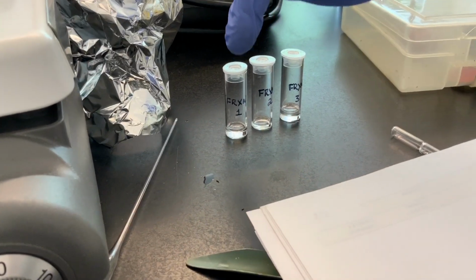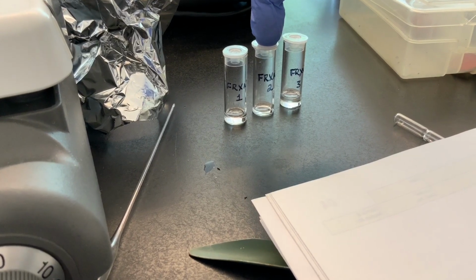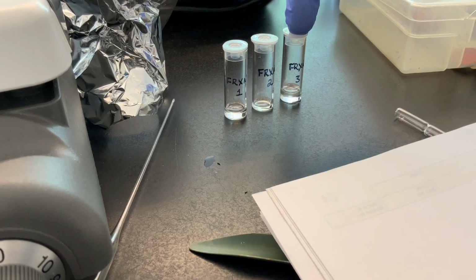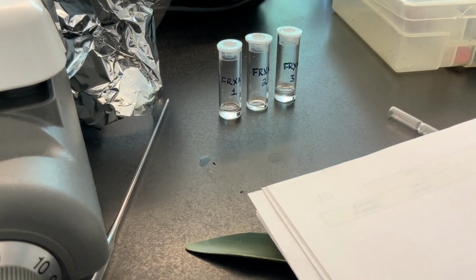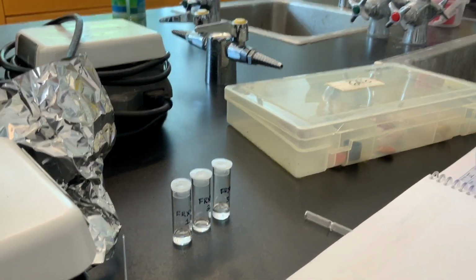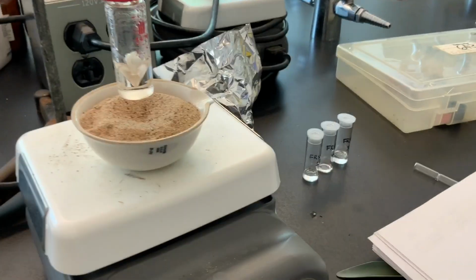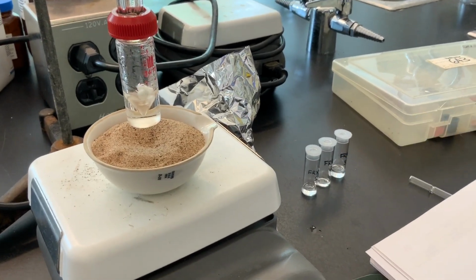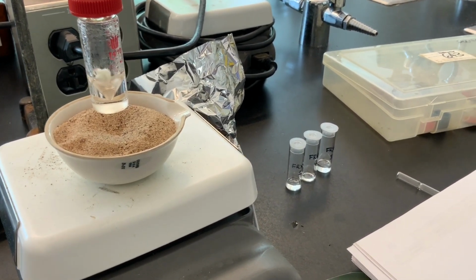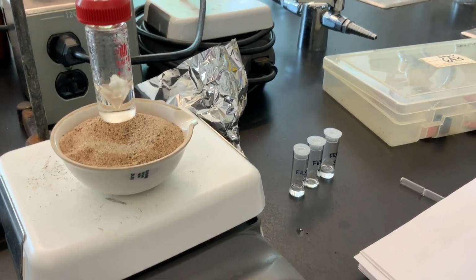Fraction 1 should be hopefully mostly hexane. Fraction 2 should be our wash, so a combination of the two. And then fraction 3 we're hoping to be just toluene. And now in order to assess our work, if we did a good job or not, we will use the refractometer and get the refractive index of each fraction. And the first thing we'll do is get the refractive index of the two standards, hexane and toluene. And so that will be a separate video next.